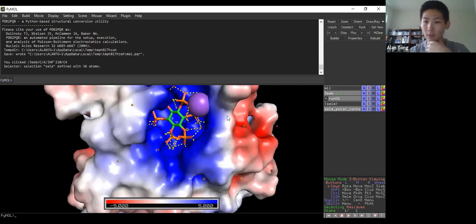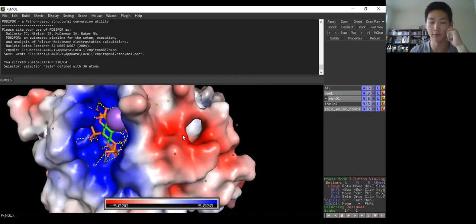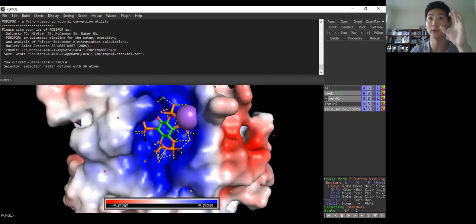What other molecules can you roll over the surface of a protein? Well, I guess proton is kind of conventional, right? As you roll a proton around this protein, of course, it's going to be higher in energy if it's around positively charged residues, and that's why this is going to be blue. It's going to be lower in energy around these red areas. We use a proton because it's positively charged. You can just as easily use an electron, but by convention, it's a proton.